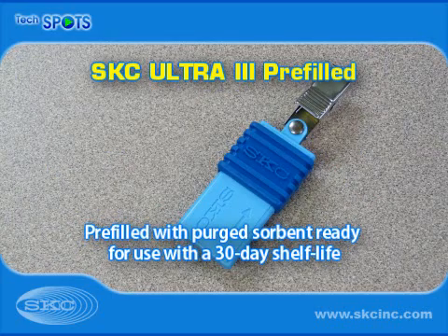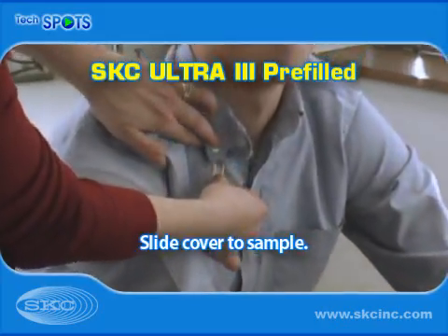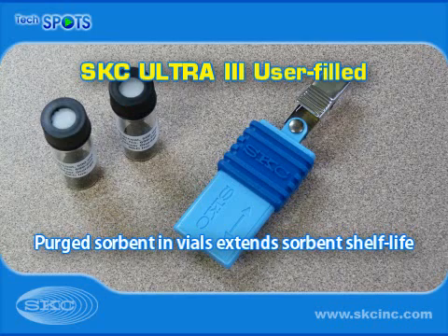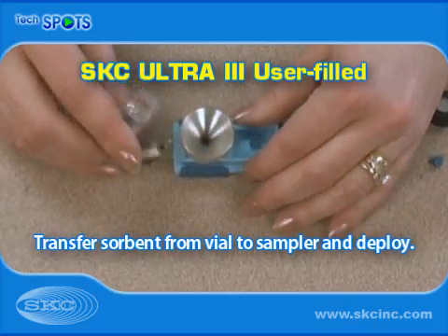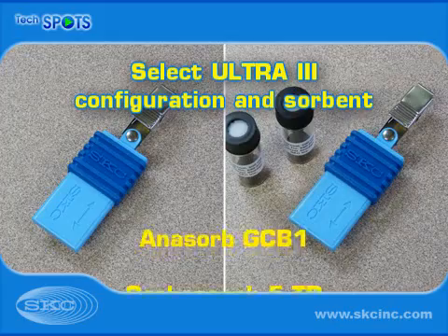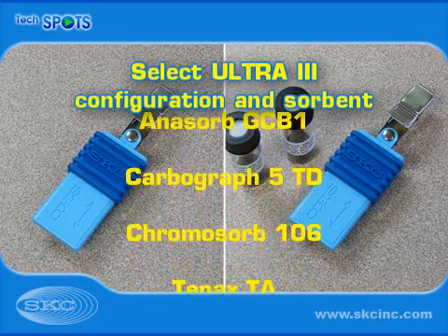Pre-Filled Ultra-3 Samplers are ready to use with a 30-day shelf life. Simply slide the cover to the open position, sample, and then close the cover. User-Filled Ultra-3 Samplers provide extended sorbent shelf life. Sorbent is stored in a separate glass vial and placed in the sampler right before sampling. Both configurations are available with a choice of five sorbents.